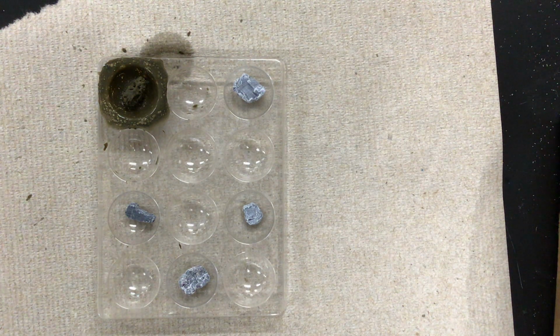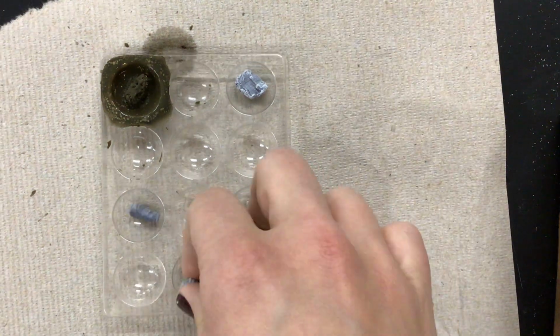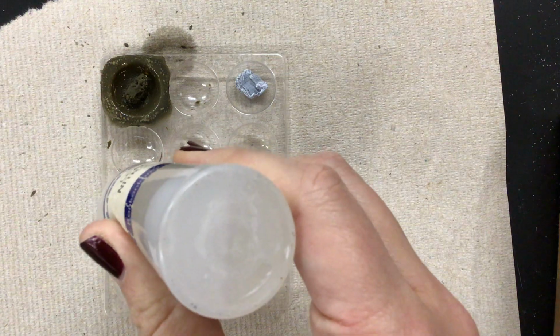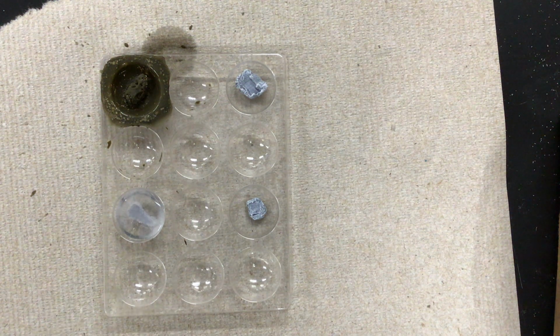The next one is lead nitrate. So our second solution is lead nitrate. Let's see if the same thing happens with our lead nitrate. I'm gonna move this piece of calcium for now. So again, this is calcium and lead nitrate. Let's see if it reacts the same way. Oh, there it's starting to go.